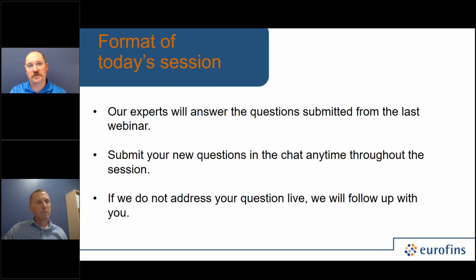We do this on a regular basis as well. We use it for a variety of reasons. Clients will use it for release testing. Other times, a client may have a low plate count result. Let's just take an example of a finished product capsule. It's expected to be 10 billion CFU per dose.